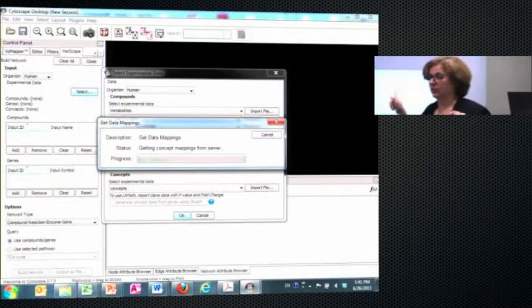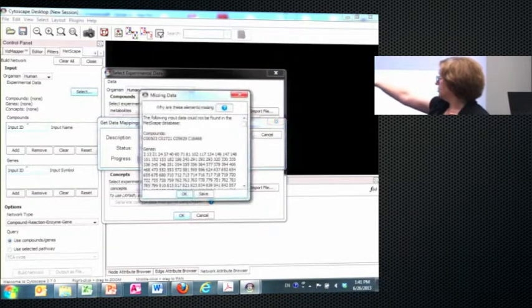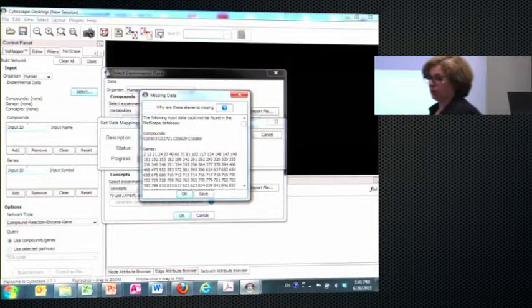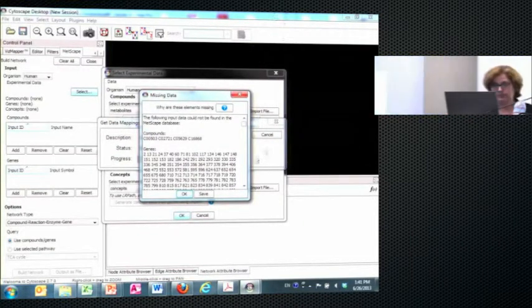What will take a long time? Right now we will just load the data, and hopefully it will populate these two fields for compounds and genes over there. Oh, okay, it just got done. But there is another step that takes a while, which is actually building a network. You remember for glycine, it was very fast, but this is going to be a little longer.